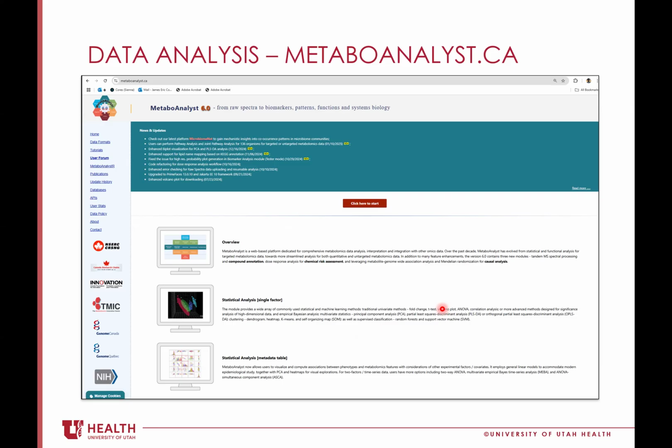So now we're getting to the point where we want you as the user to be able to manipulate your own data and build your own charts, or your own graphs. And this particular program will do that. The nice thing about the report that we send is that we give you instructions on how to do that online. So you'll not only have the data that we sent with a lot of different graphs and charts, depending on what you want, but you can go and see if you can match that up with this particular software platform.